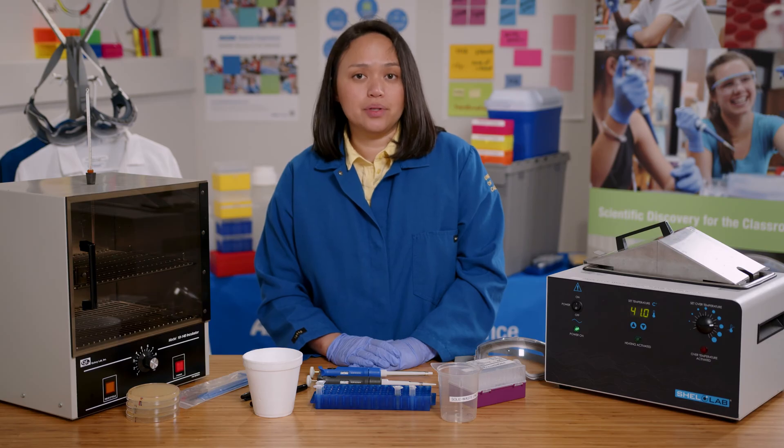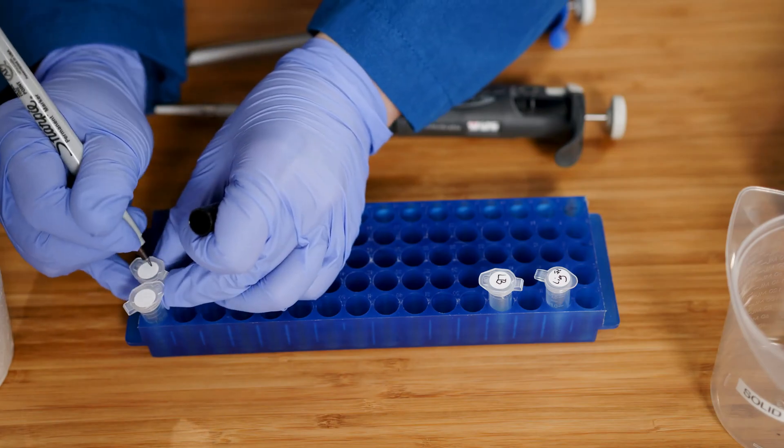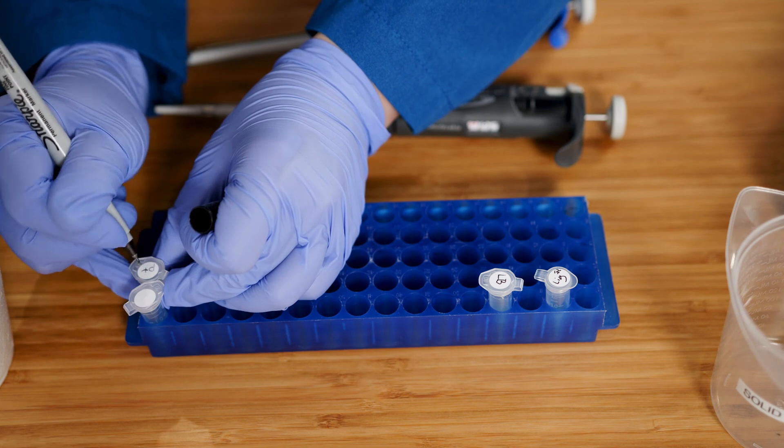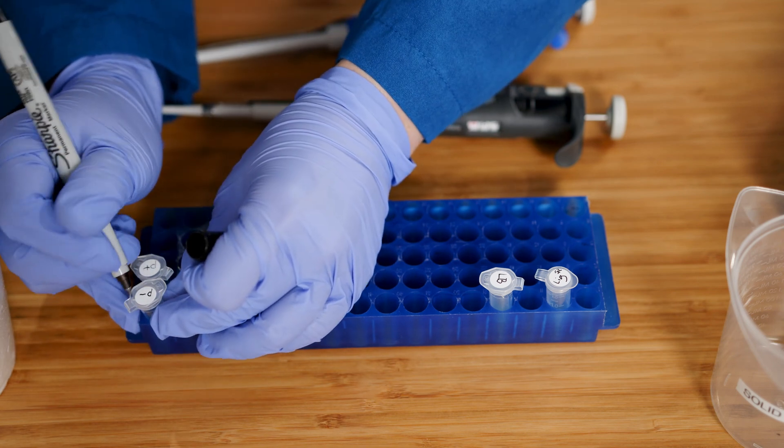Wash your hands before and after conducting the lab. Before I begin, I need to label the tubes. P plus is for the experimental setup, and P minus is for the control setup.